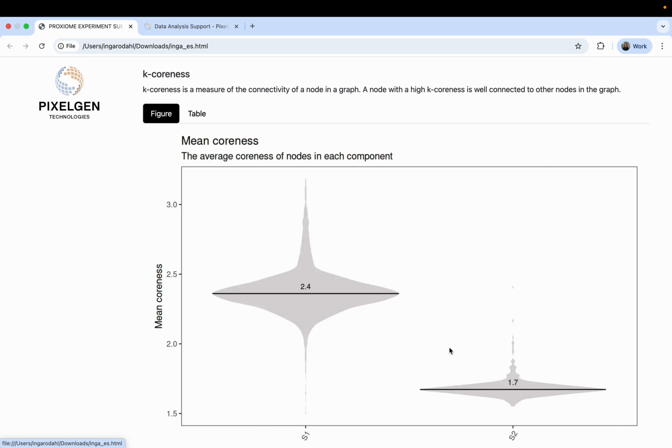The experiment summary also does an automated cell annotation based on a reference PBMC dataset. We do suggest to take a bit of caution in interpreting this annotation, especially if you're running any cells that are very different from PBMC, for example a cell line or an enriched population. In those cases, this annotation may be incorrect. But in this case, we are running PBMCs, so we can have a look at the output.